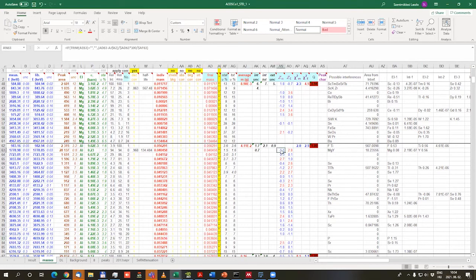And this is the standard deviation from the average for the masses, and this is for the energies. If you see outliers here, like here, this is way too high, then you can remove this line, and then this deviation disappears, and this final value is recomputed.